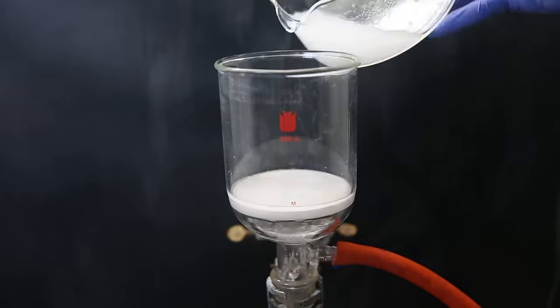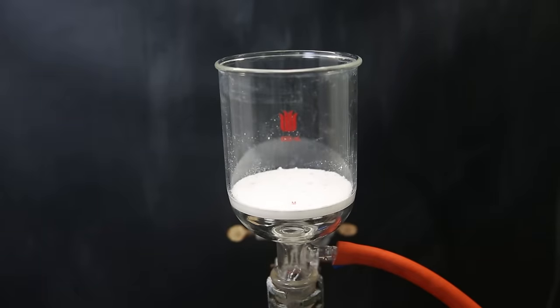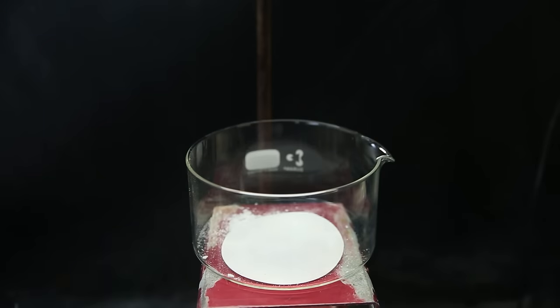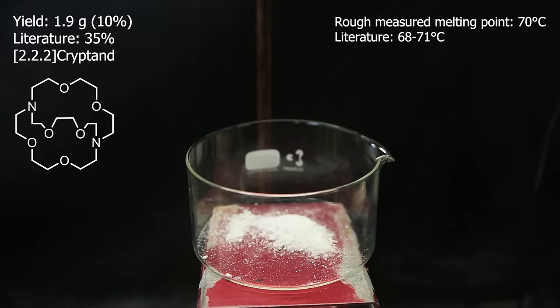I then set this up for filtration, and I washed it with some cold hexanes. I let it dry in the filter for about 15 minutes, and I then move it all to a crystallizing dish. Then I am left with 1.9 grams of what should be 222-cryptand, which is a sad but respectable yield of 10%. I also did a rough measurement of the melting point, which gave 70°C, so it seems to align with the literature.